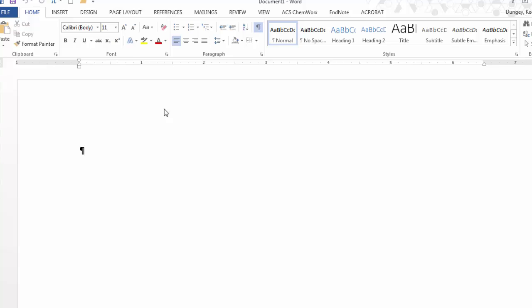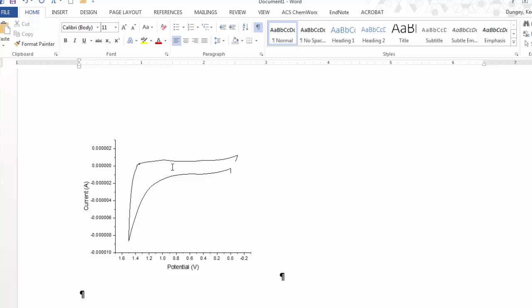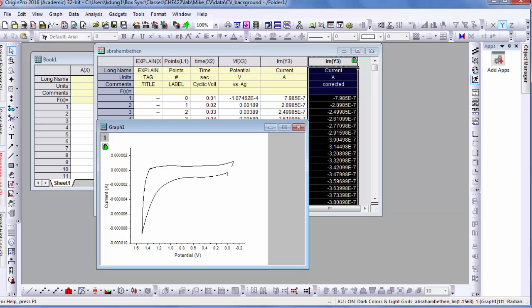I also want one example of the different scan rates with the ferrocene sample for your report. So here control V. And there's your graph. So that's very flat. That's good news for our background.